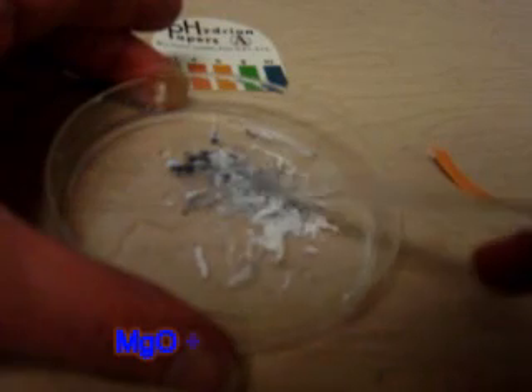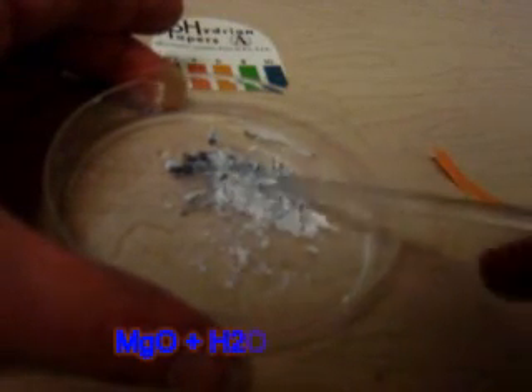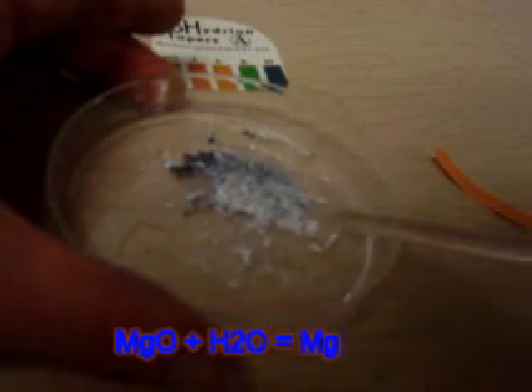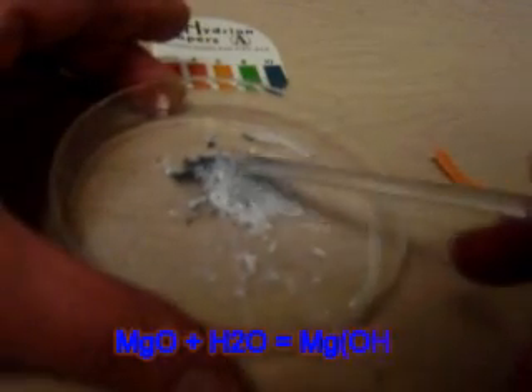And I'm going to add water to it. This in itself is a chemical reaction — Magnesium Oxide plus H2O water will give me a new formula, a new compound which is Magnesium Hydroxide. And how do we prove that?